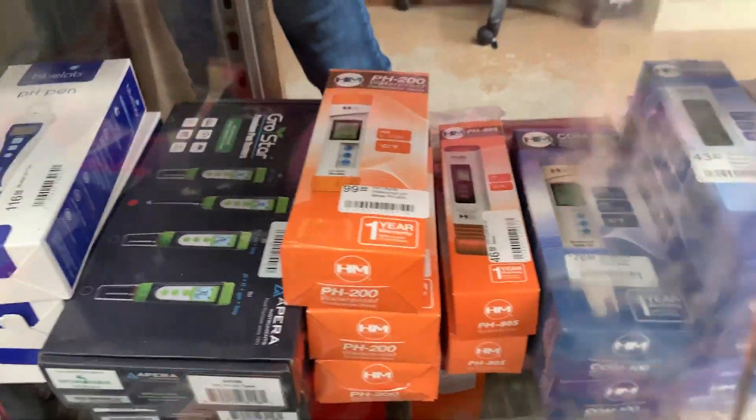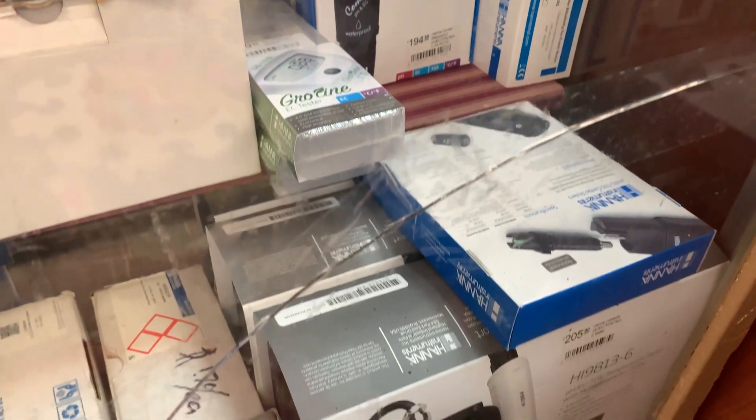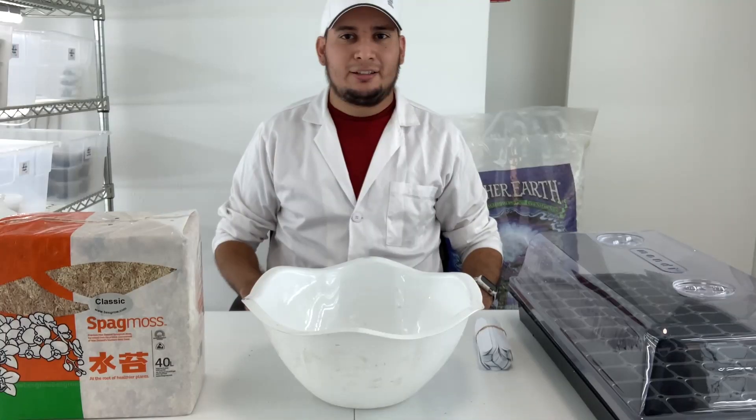I think it's time for me to upgrade my current pH meter to something more professional. The one I want to get will have a separate probe so I can use it on smaller bottles — something like these two pH meters here on the bottom. I think I will get something similar to this.